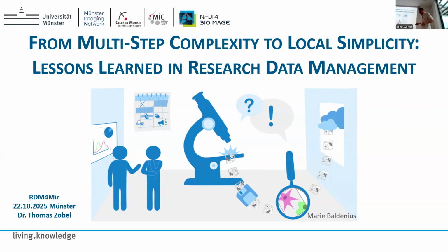And so we thought, or I thought, that we train more the local data management, because they are producing images directly at the microscope, and we have to train them how to save the local files in a good way.